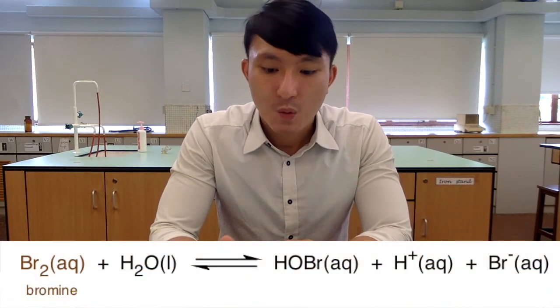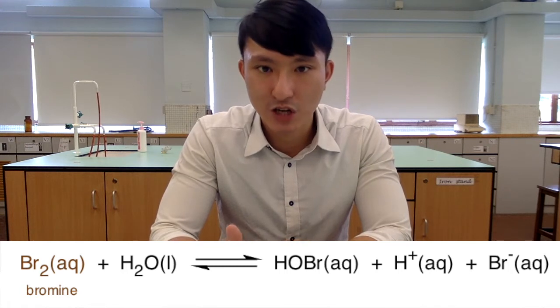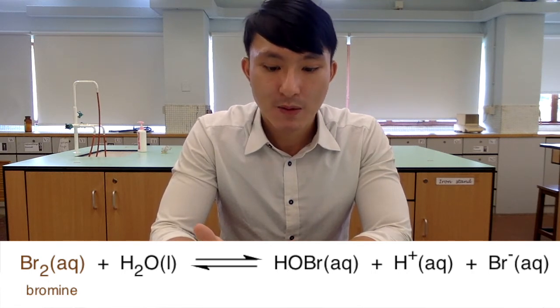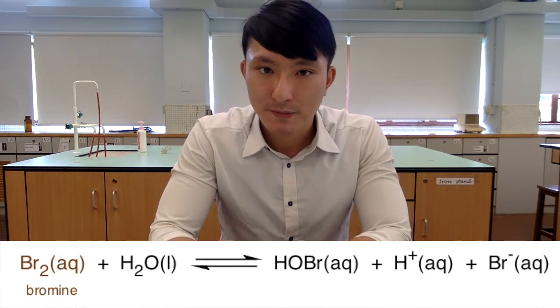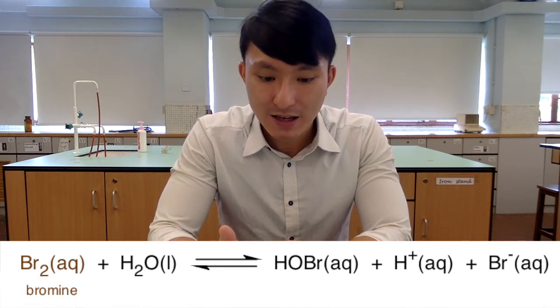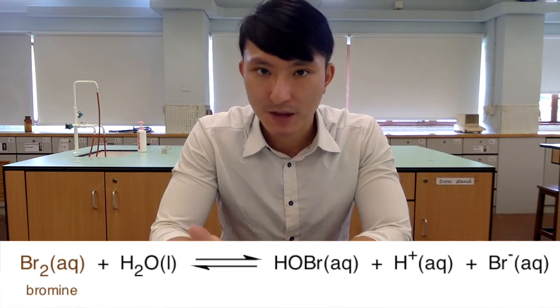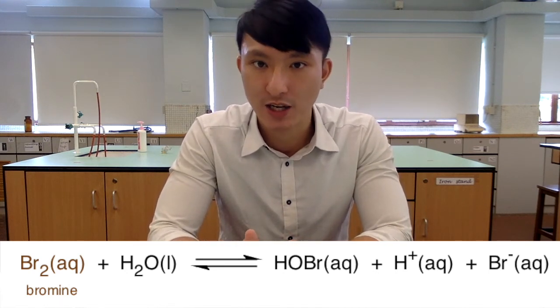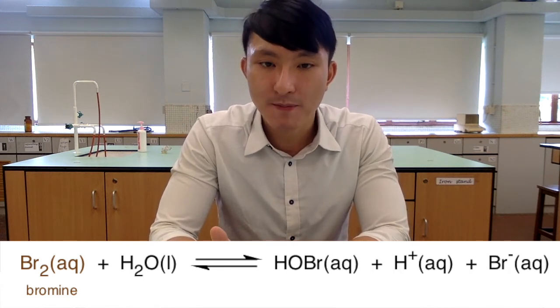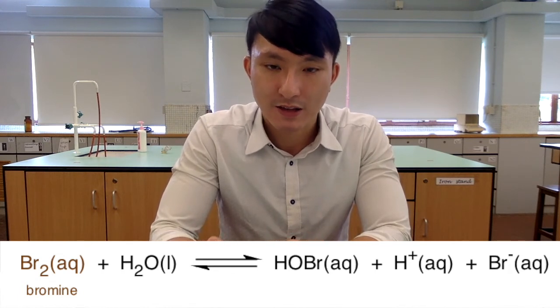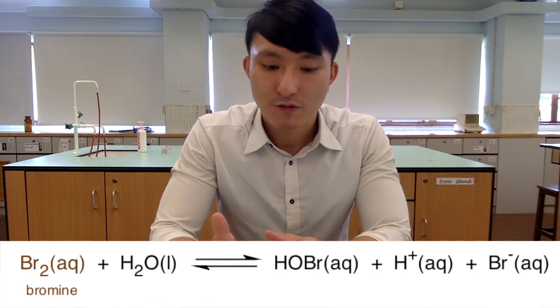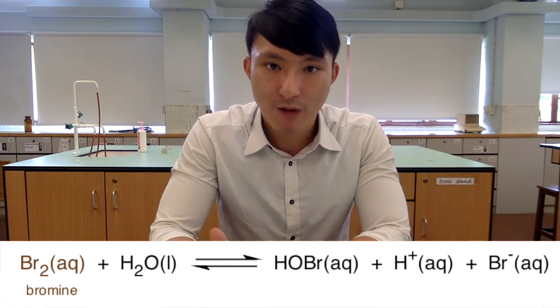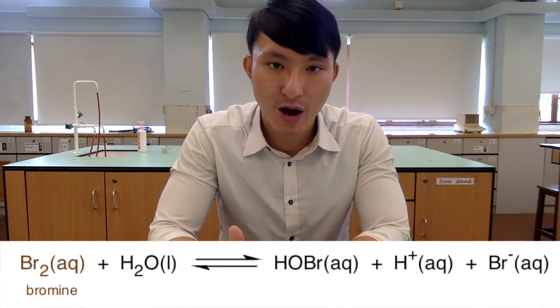For the second equilibrium system, when we add sulfuric acid into bromine water, the color doesn't change much. Adding acid increases H+ concentration, shifting the equilibrium to the left and producing more brown bromine. Since the mixture is already brown, the change is not very obvious, though theoretically the brown color intensity should increase. When we add sodium hydroxide, it neutralizes the H+, shifting the equilibrium to the right, consuming more brown bromine and producing more colorless products. The concentration of brown bromine decreases significantly, so the reaction mixture changes from brown to colorless.